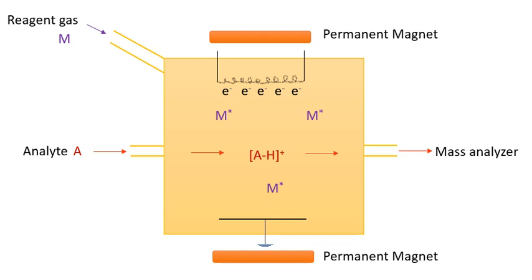Because not all analytes can do this, using NCI provides a certain degree of selectivity that is not available with other, more universal ionization techniques, such as PCI. NCI can be used for the analysis of compounds containing acidic groups or electronegative elements, especially halogens. Moreover, negative chemical ionization is more selective and demonstrates a higher sensitivity toward oxidizing agents and alkylating agents.